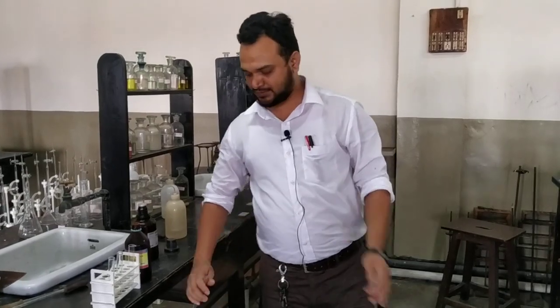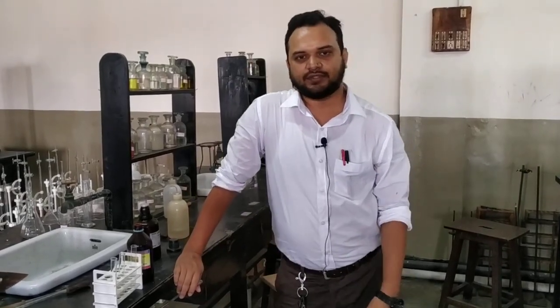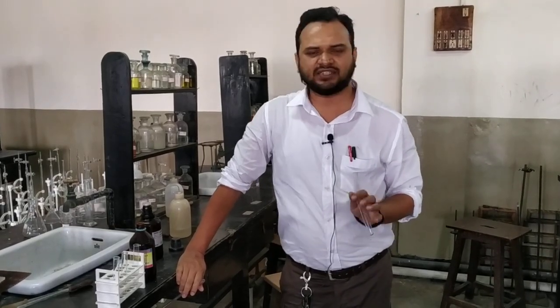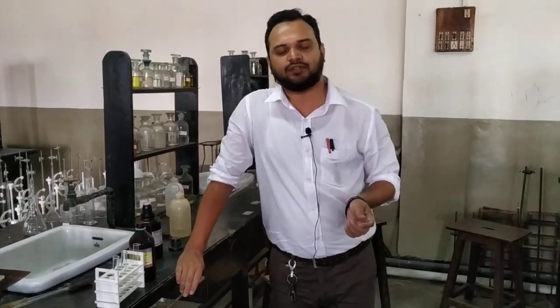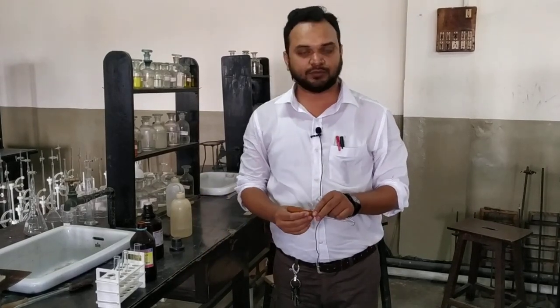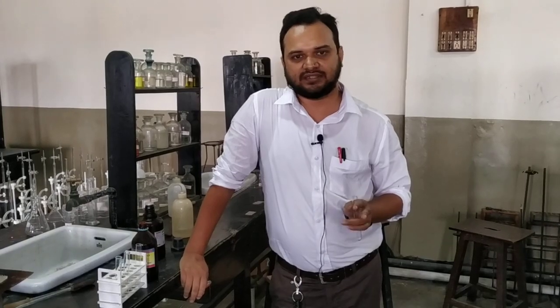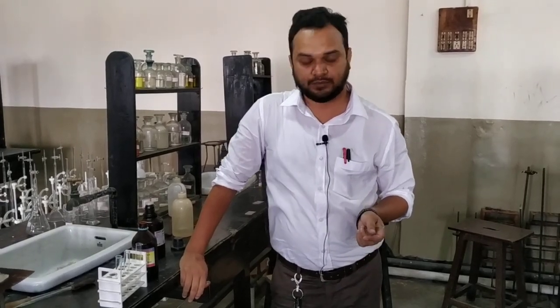Hello everyone, here we arrive again with the fifth test for aniline that was remaining. So that is a very simple test. You know the reaction in your theoretical syllabus also, that is reaction with bromine water. We have two aromatic compounds in our syllabus to react with bromine water.